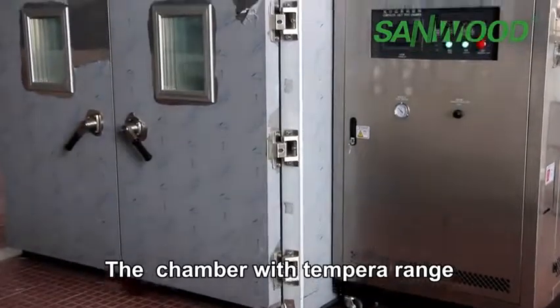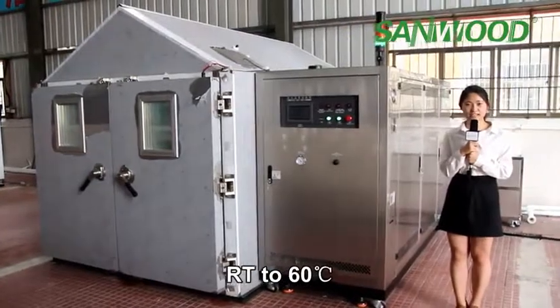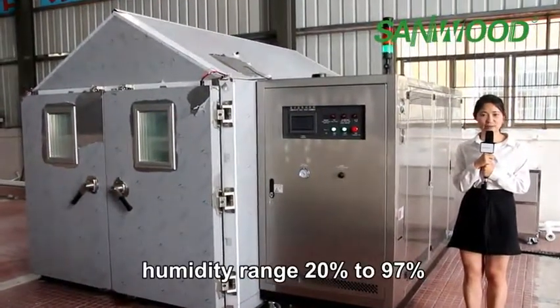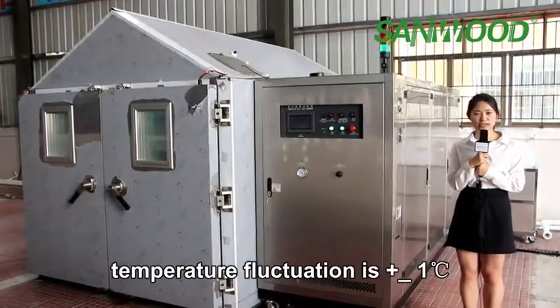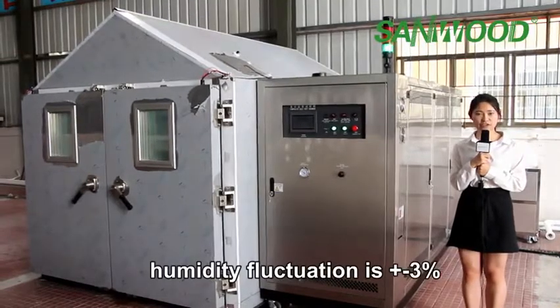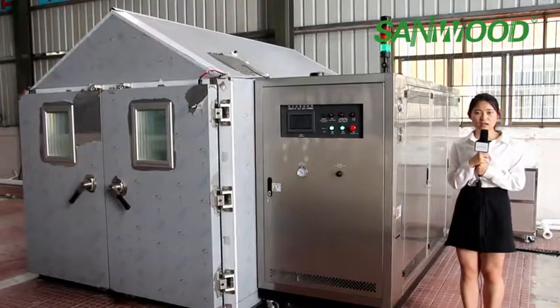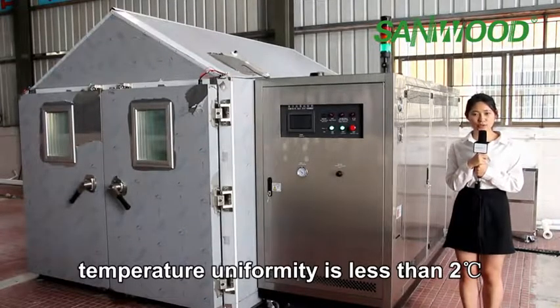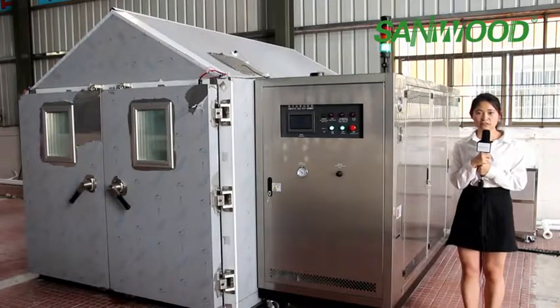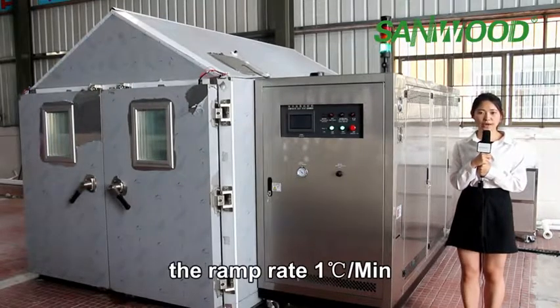The chamber has a temperature range from room temperature to 60 degrees, with humidity range 20% to 97%. Temperature fluctuation is ±1°C, humidity fluctuation is ±3%. Temperature uniformity is less than 2°C. From 50 to 40 degrees, the ramp rate is 1 degree per minute.